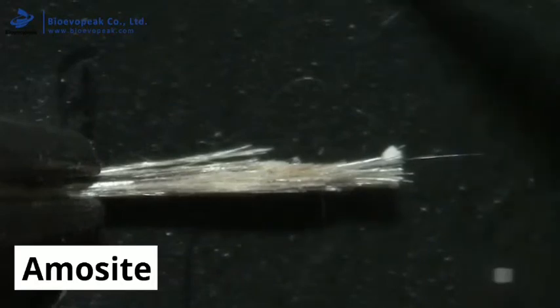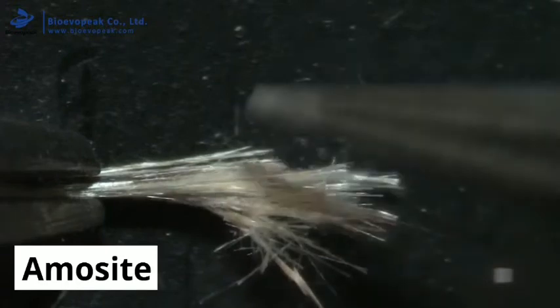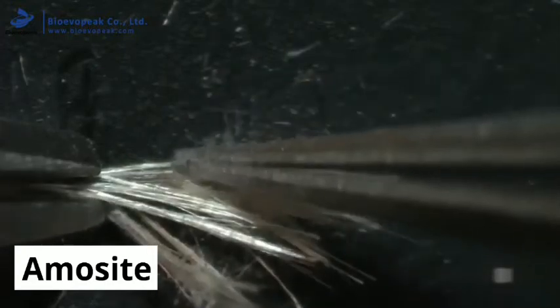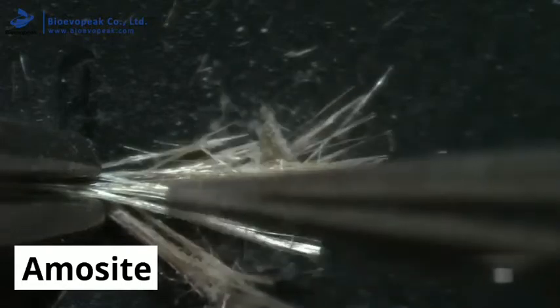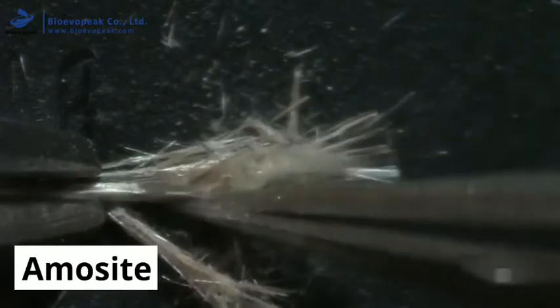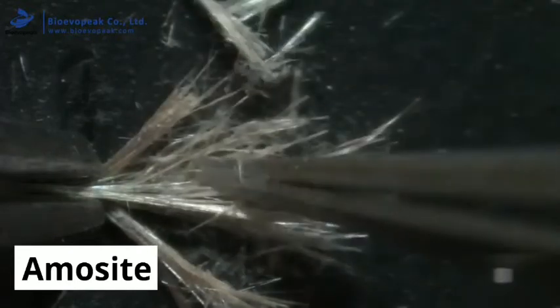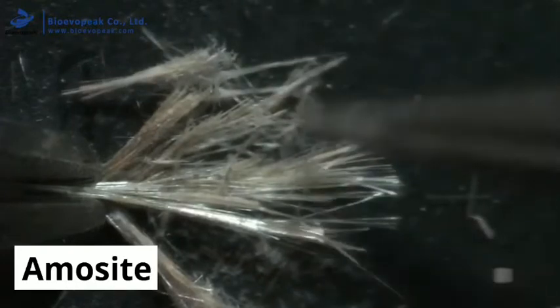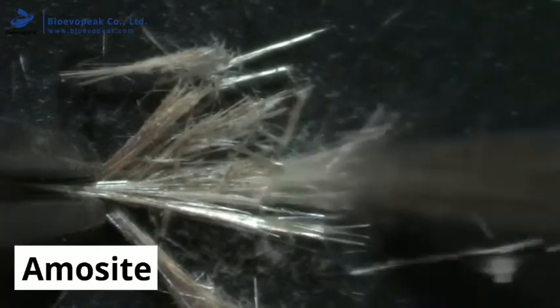Amosite presents as short, straight, grey to brown coloured fibres that have a paintbrush end effect or form in small bundles. The analyst would assess the fibre by first separating them from the sample and then manipulating them under the microscope. Here you can see that amosite fibres are straight and very brittle, shattering quickly when brushed with tweezers.